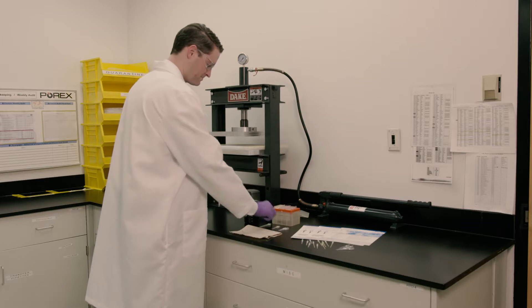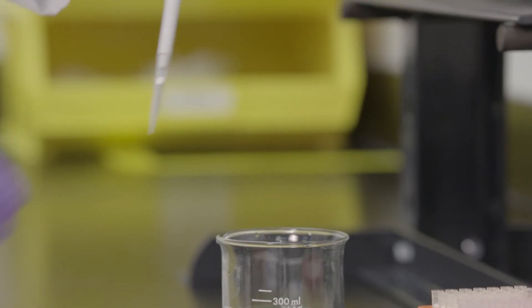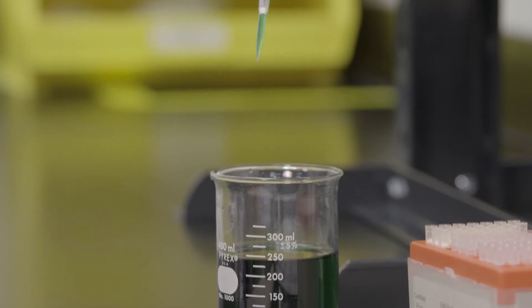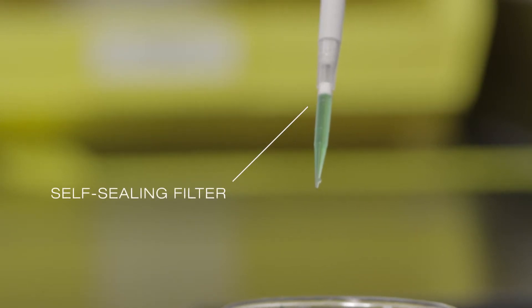Filter B is a self-sealing filter pipette tip. Watch again as we aspirate 300 UL. The green sample does not go through the filter. This is because the filter material is designed specifically with material additives that allow the filter pores to swell to create blockage of fluids in the sample.